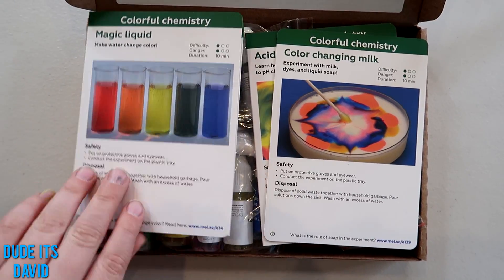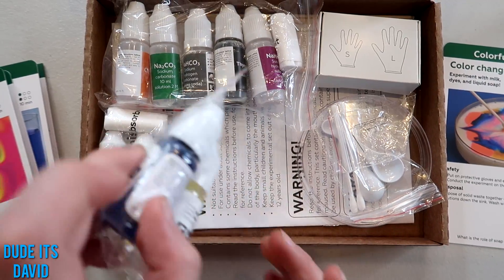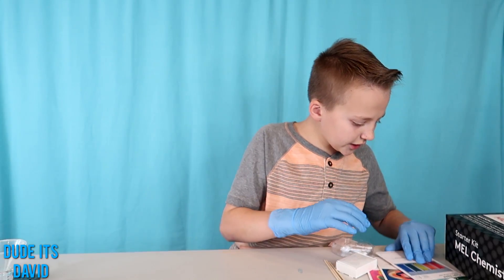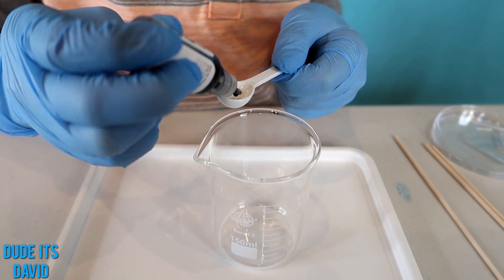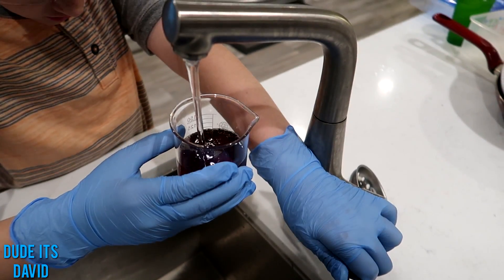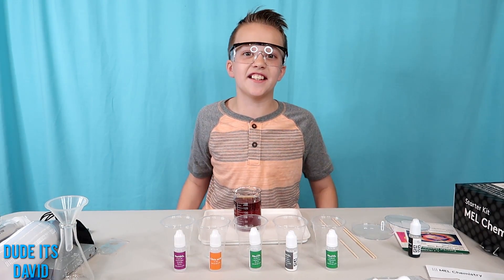This is cool — looks like there's a couple different experiments in here: a milk one, and this one looks cool with a lot of different colors. Here are the gloves. The promo link gives you 25% off on your first month. I think we're going to do the magic liquid experiment. First I'm going to add some thymol blue pH indicator, and now I'm going to fill up the flask with water. That's an interesting color. Now we're going to make five different solutions and see how they react with the pH indicator.